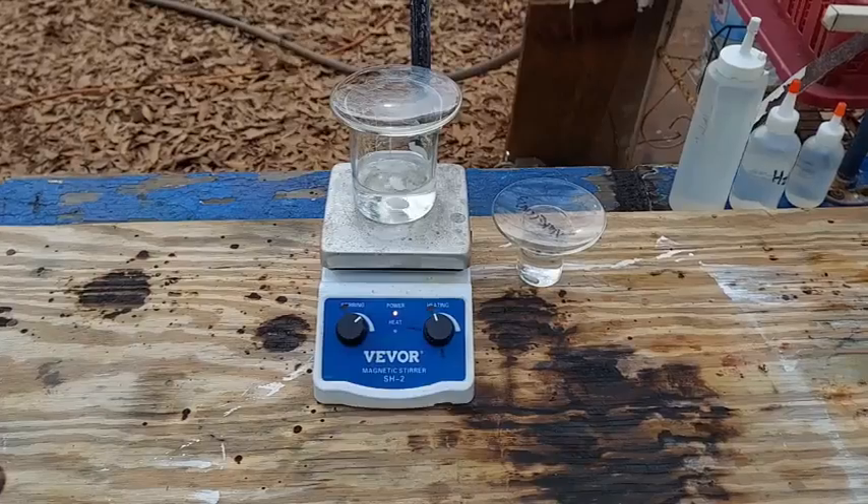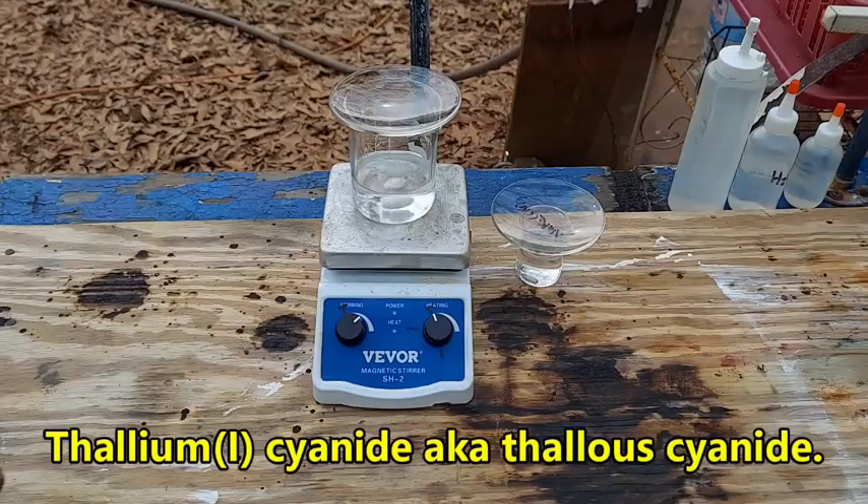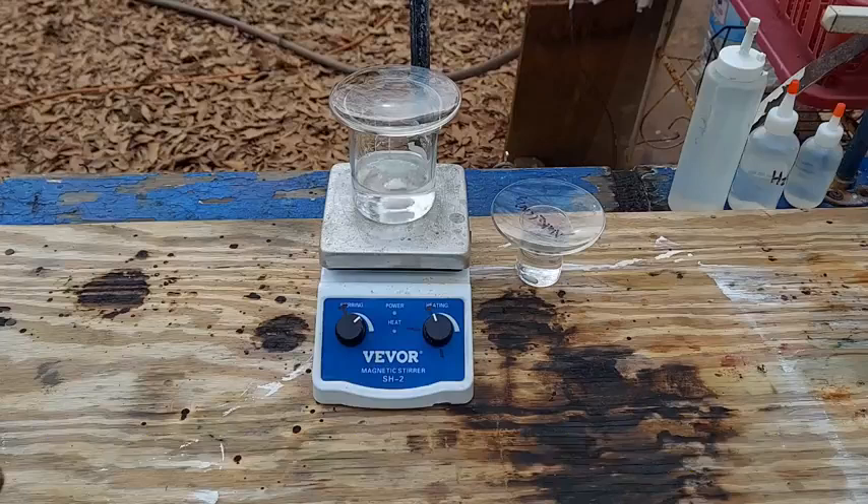Hello everybody and welcome to the Poor Man's Chemist. In this video we are going to be making thallium cyanide, the culmination of my work over the last couple of weeks. This should be very simple and straightforward and to the point.